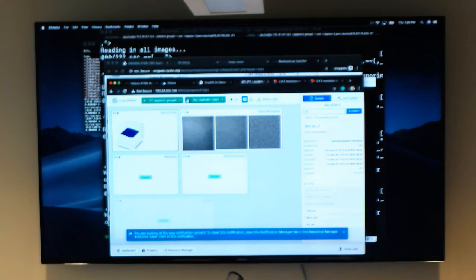Just because conceptually that's how it's done doesn't mean that's how it's implemented. Yeah, probably it's replicating it by the symmetry, because by adding symmetry, it uses up different RAM. VRAM must be. Otherwise, why are we running into memory issues?